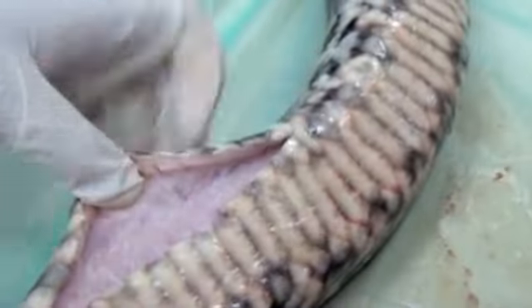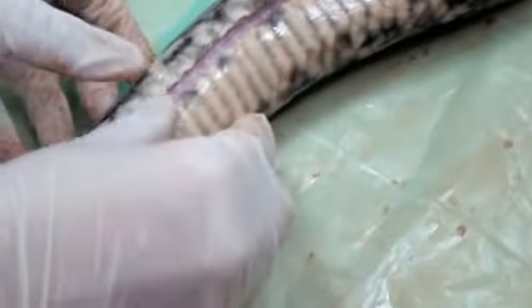Okay, let's see what we can see before we break. We're going to let you cut in just a minute. Okay, guys, stay with me. Let's see what we can see. As we open it up, you've got layers. We already see some fat.